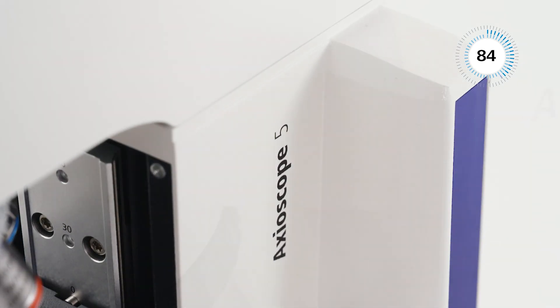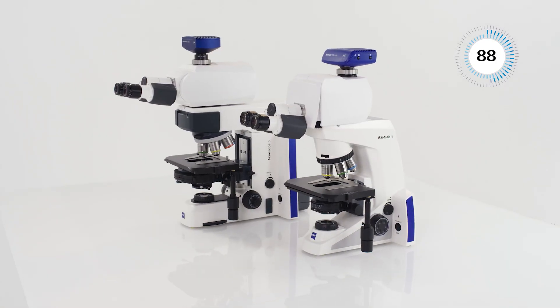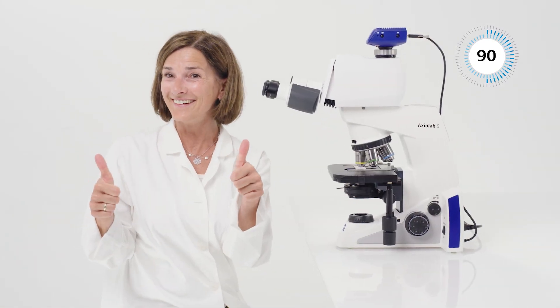Axiolab 5 and Axioscope 5 are made from metal. You can rely on the stability of these microscopes, even with extensive use. For further information, visit our website.